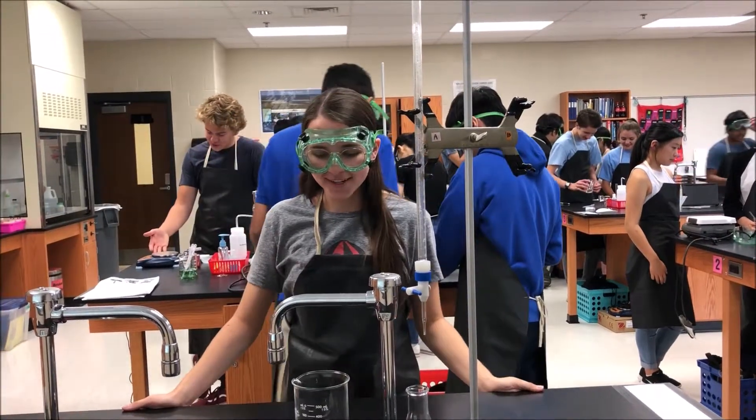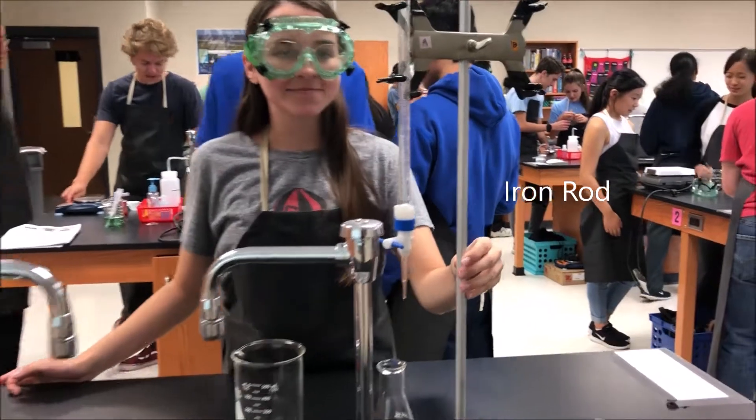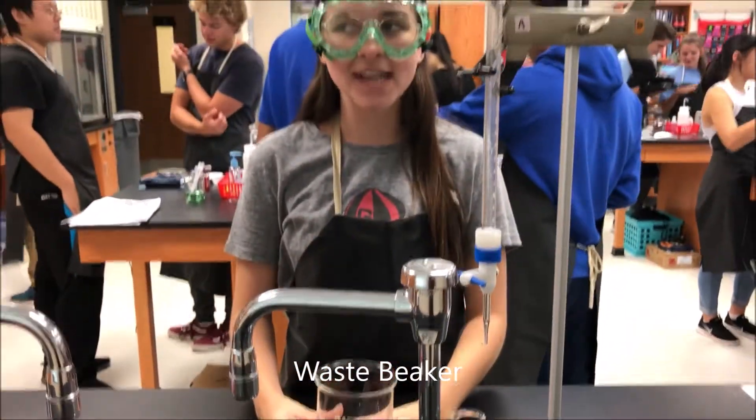Hey, I'm Annabelle. We're going to do a titration today. You're going to need the rod, the burette clamp, the burette, an Erlenmeyer flask, a waste beaker, and titrant.